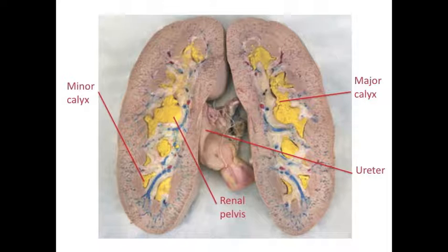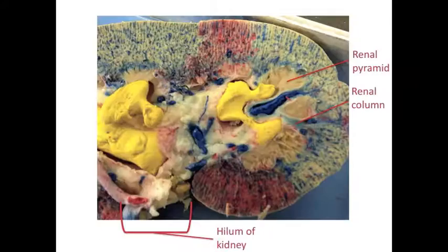Together, these come together in a single structure called the renal pelvis, before draining into the ureter. The renal columns house the vasculature elements that allow arterial blood flow towards the cortex and venous blood flow away from the cortex. The renal pyramids house the collecting ducts, which permit the movement of filtrate from the glomeruli to the minor calyces.